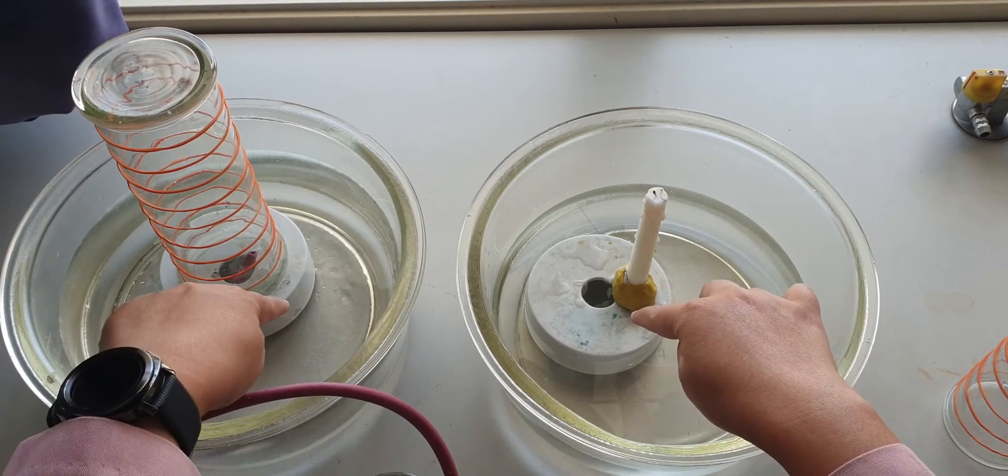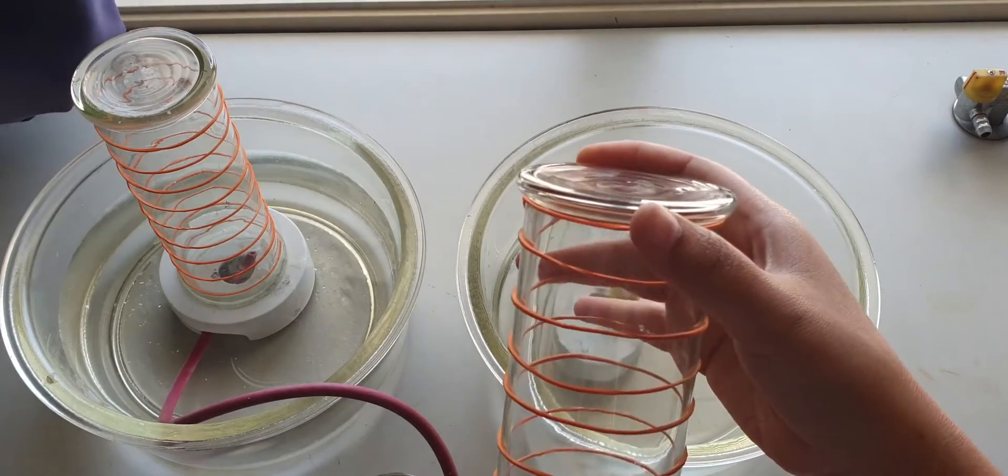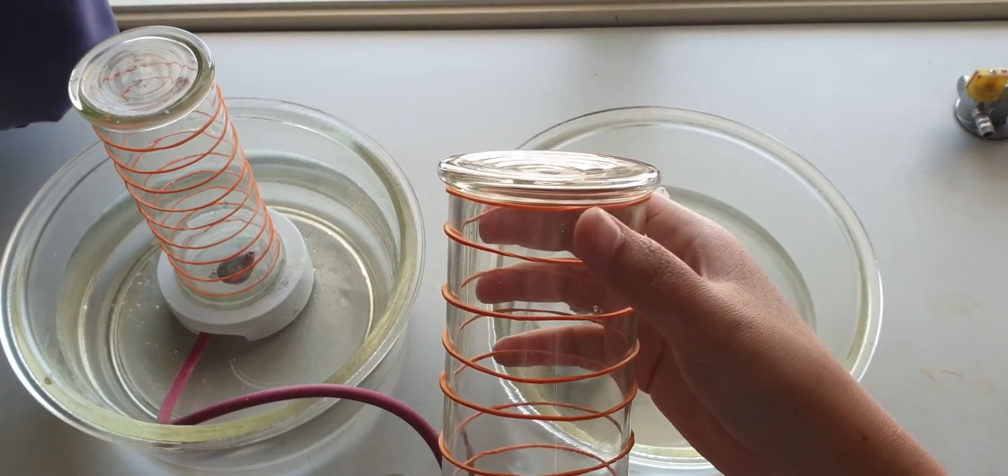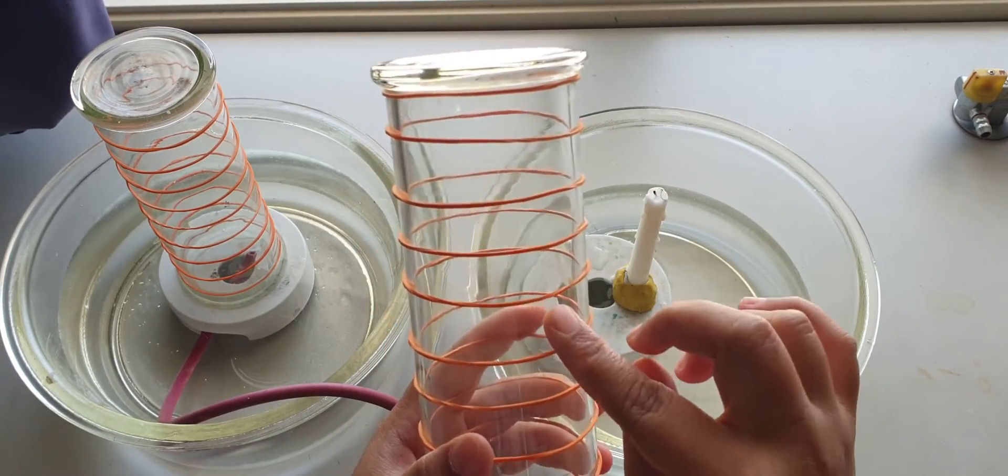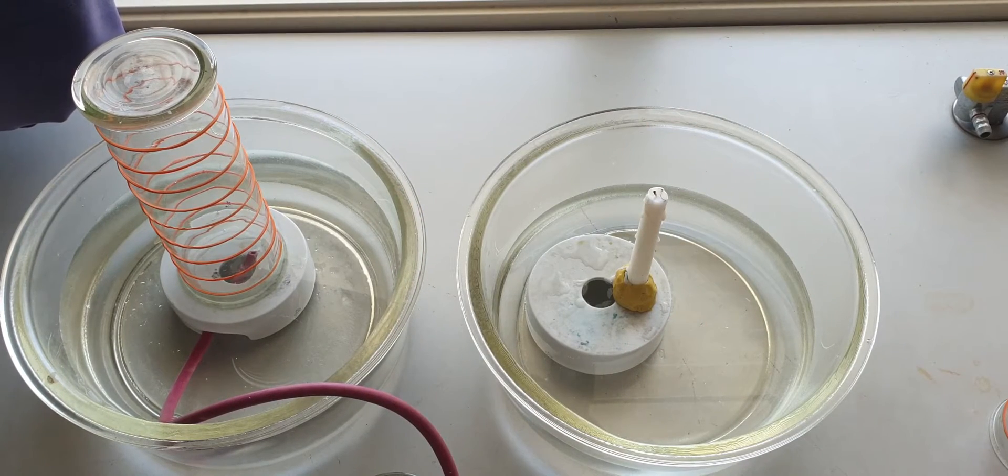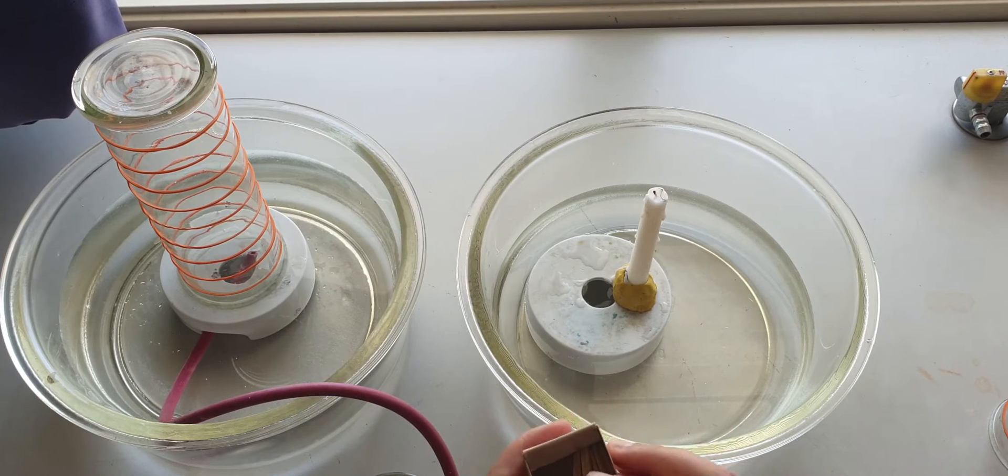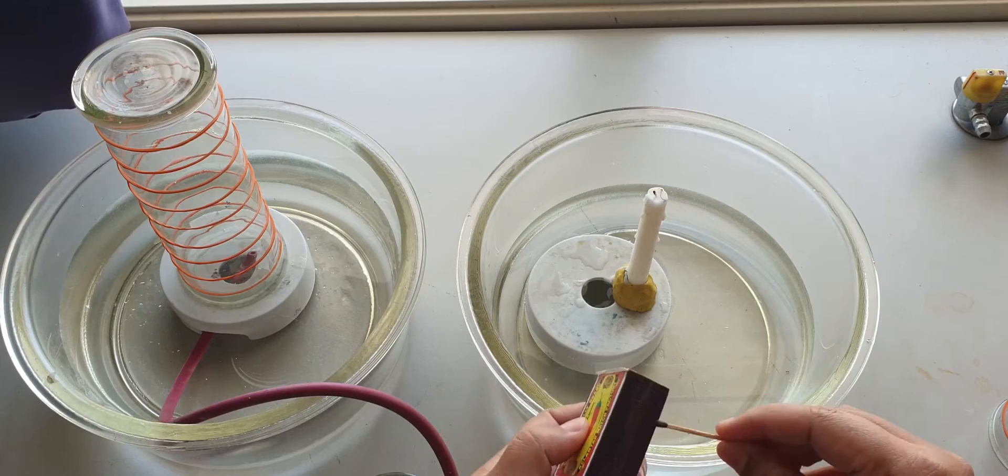What you need to do first is to divide the gas jar into ten equal parts: one, two, three, four, five, six, seven, eight, nine, ten. And then you need to light up the candle and insert the gas jar containing the inhaled air into the candle.